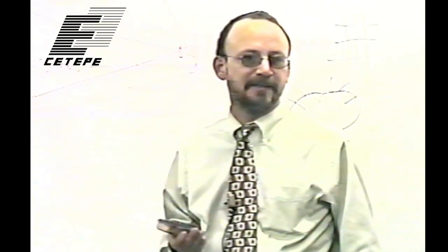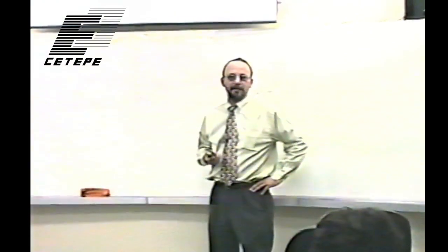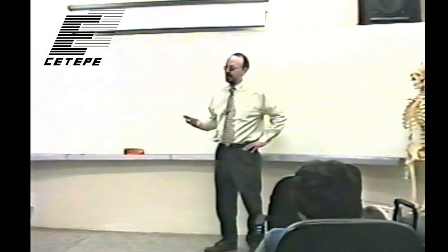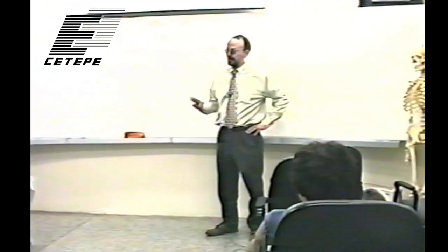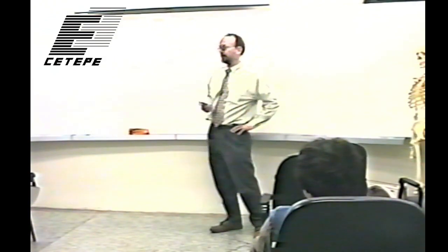And I'm having a little bit of trouble thinking of how to do an experiment to characterize it. But just from looking at our images, I estimate that our dynamic range might be about 200 to 300, maybe 500 at the highest. So you see that's certainly less than 10 bits, possibly as few as 8 bits of real information that you have there.